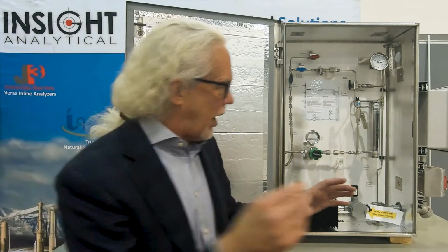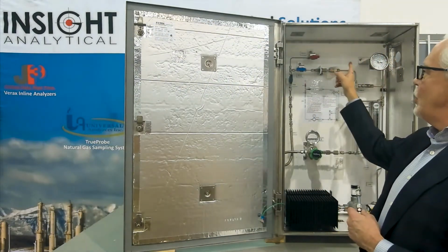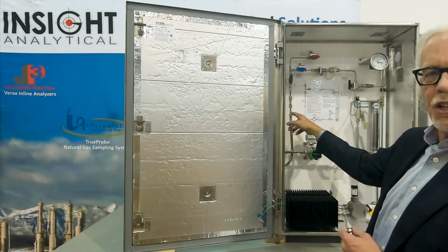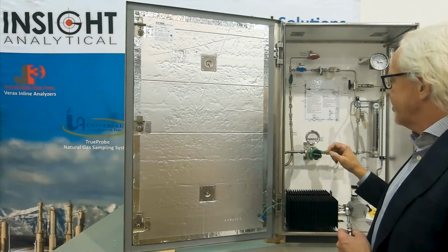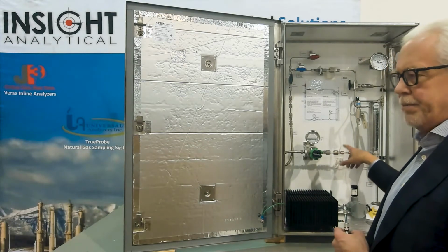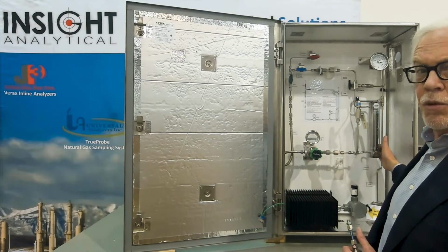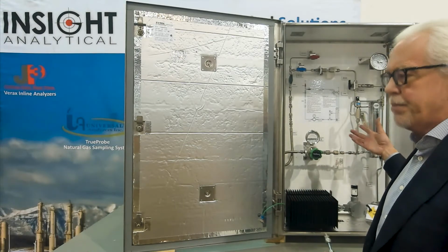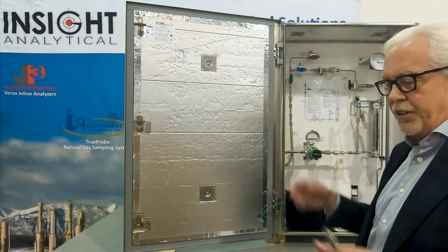So we put this trap into a panel like this one here, and we allow the natural gas to come in and flow over the trap at full line pressure. This absorbs dithiazine in the trap. The pressure is dropped at a regulator and the flow is controlled with a flow restrictor. We measure the flow. In this case, it's a Div1 panel and we're using a mechanical rotometer. For Div2 panels, we use integrating mass flow meters. And so we have a mass flow meter that says this is the total volume that went over the trap.